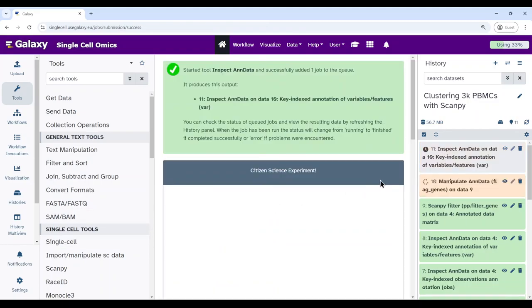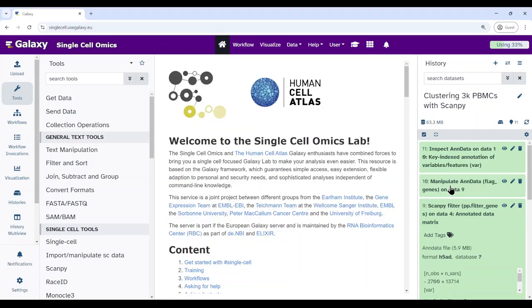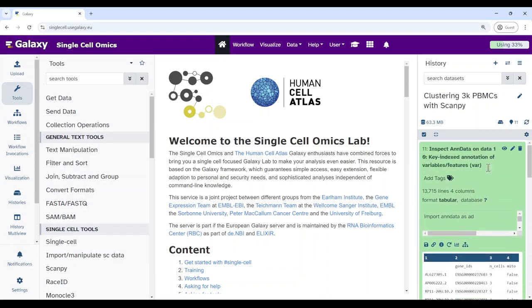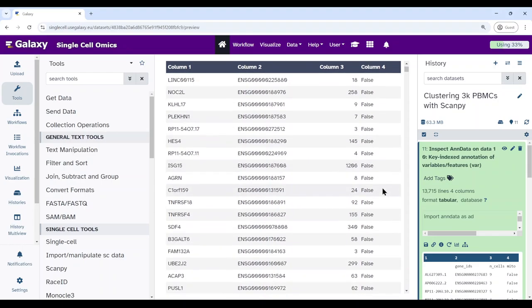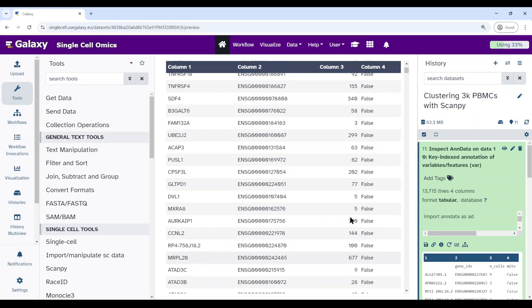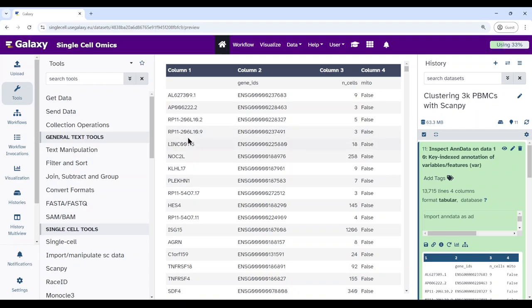Run the Inspect AnnData tool on variables to confirm. Looking at the variables annotation, we see gene symbols, gene IDs, number of cells this gene is expressed in, and the newly added 'Mito' column. This column says whether the gene is mitochondrial or not. Since none of the top genes start with 'MT-', they show false. If you scroll down to genes that start with MT, you will find true values indicating they are mitochondrial genes.